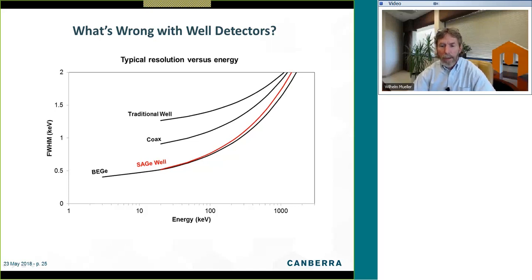because of the impact of the amount of background. As you saw earlier from Will, detection limits increase as the square root of the background counts, or decrease as the square root of the reduction in background counts. And because the resolution affects the number of counts in your background, you could extrapolate that to say that the detection limit improves as the square root of the reduction in resolution, all by itself, nothing else taken into consideration.